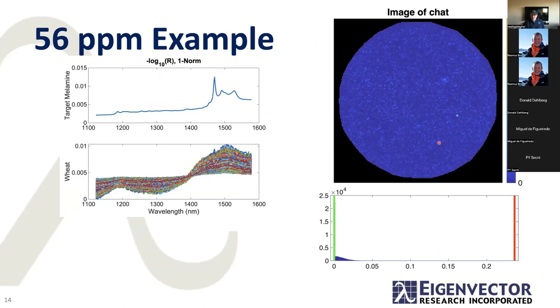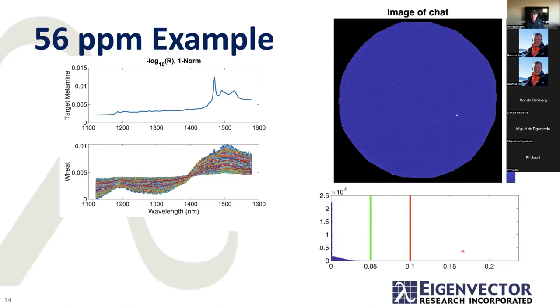And you can see that here's the distribution of the pixels, that most of these pixels, the wheat gluten, is down here. And my detection, this guy, is out here on this area. And I can start playing with this by squishing down on the red one and squishing up on the green one. And I can kind of almost binarize the image and see, aha, I've got a detection there. But if I look real close, I've even got something small there. And what is it? What does it look like?